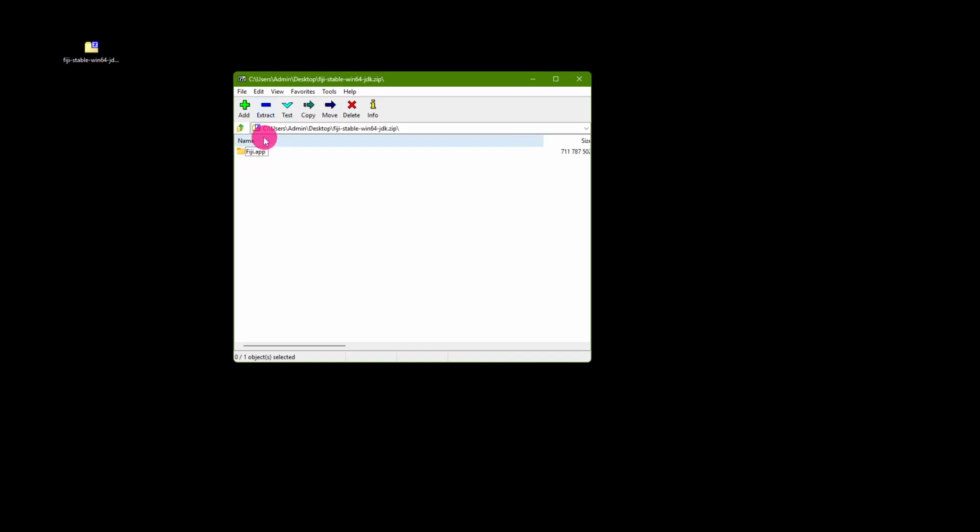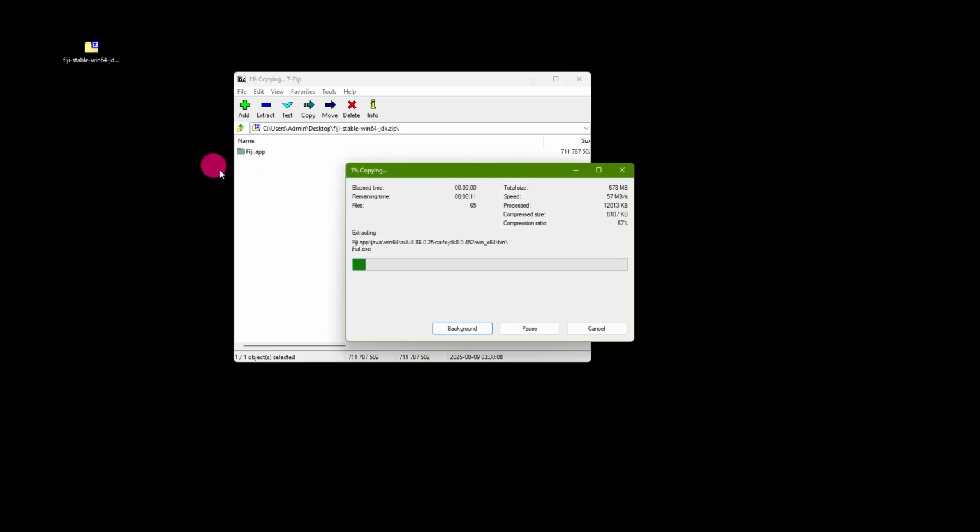On a Mac, this normally works by double-clicking the zip file. On Windows, you can right-click and extract it with the Windows options, or if you have a separate zipping tool like 7-zip, for example, then you can also use this and extract or drag to the desktop.